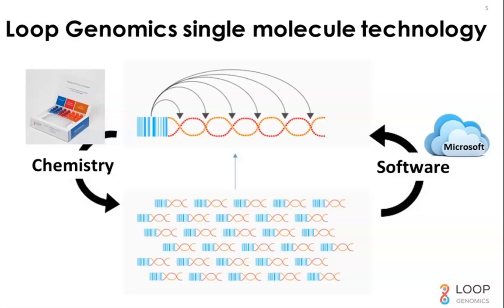Yeah, Nick, if you have anything to add, please chime in. Yeah, I think that basically covers it because the assembly is de novo based on the barcodes. There's no stringency in that consensus sequence that Loop produces. When we get the FASTQ file, there are a bunch of benefits to the data being very accurate in terms of the types of stringency that you can use for an alignment-based approach to a 16S database. In contrast, you have to make a whole different set of trade-offs with something like nanopore data. But no specific stringencies upstream of the FASTQ file come into play here.